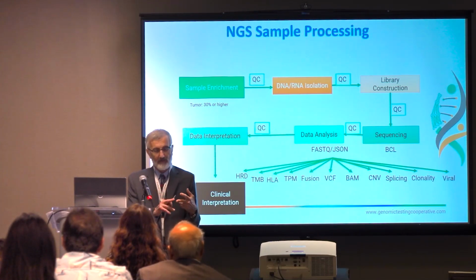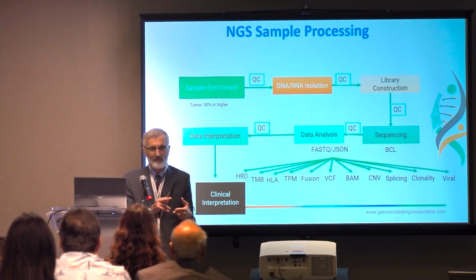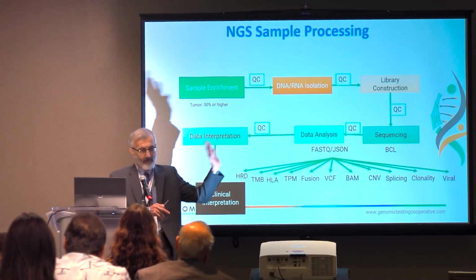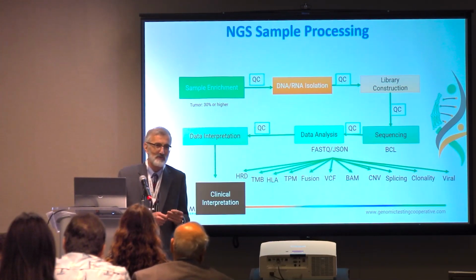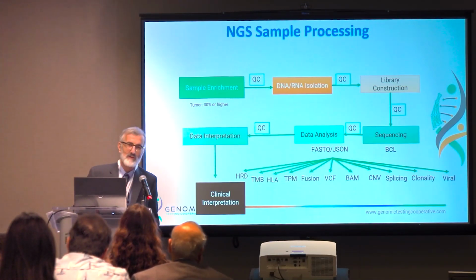As you know, and you alluded to, Thermo Fisher will generate different artifacts from Illumina, and I don't even want to think about what artifacts complete genomics will generate. Yeah. So you have to be very careful, absolutely.